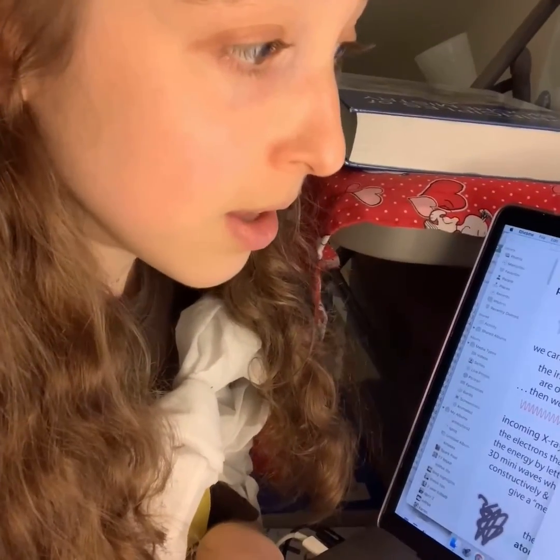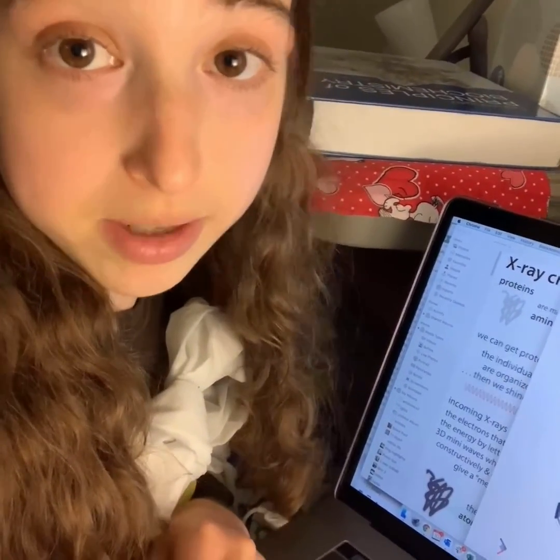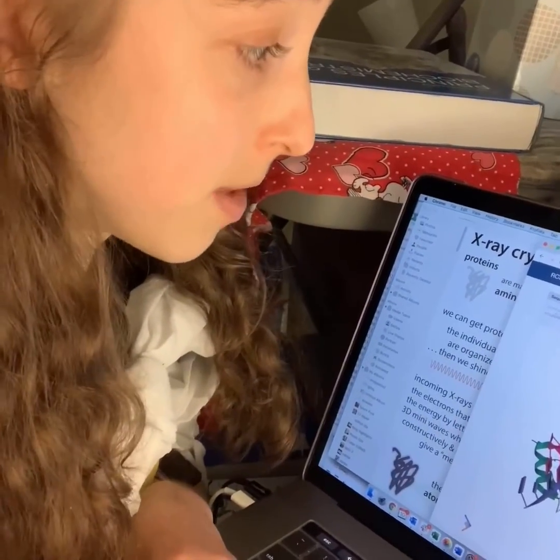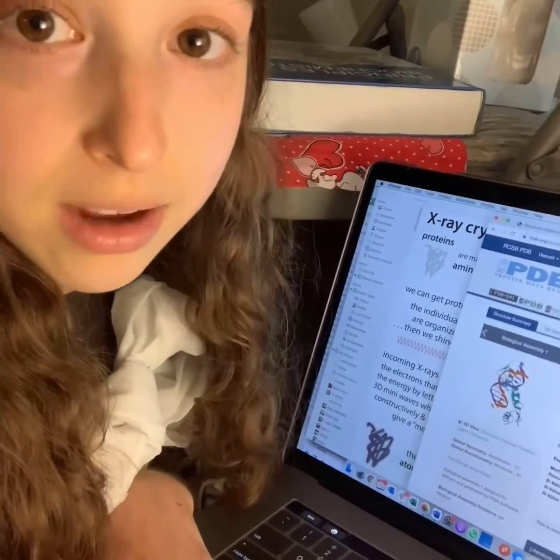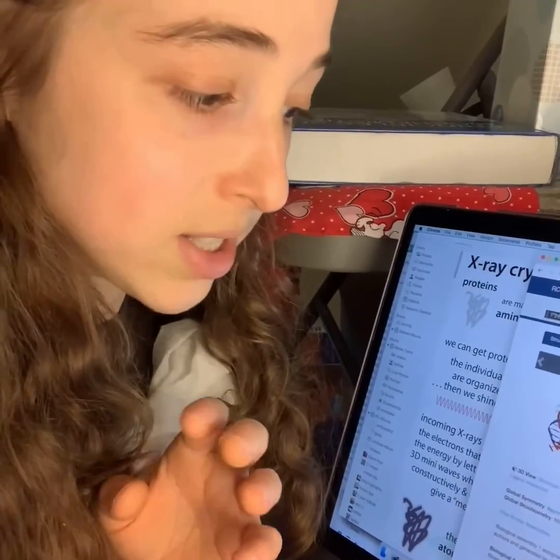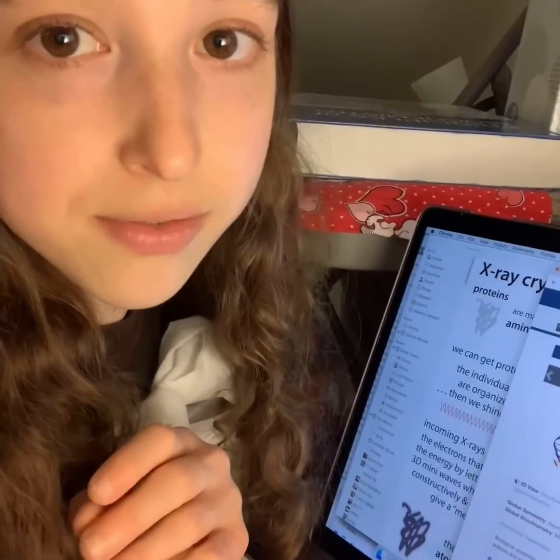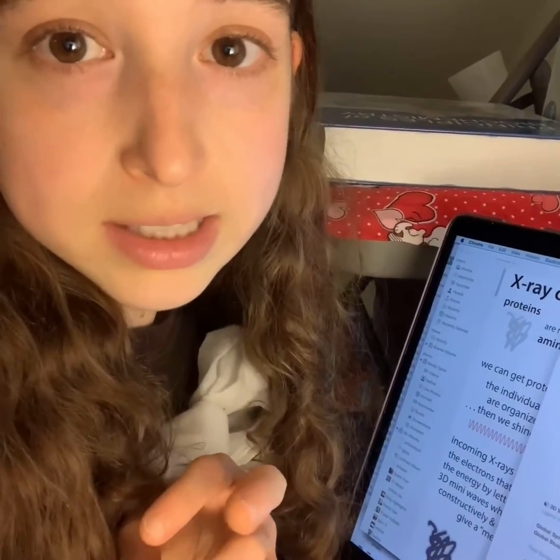the PDB, to find these various structures that you might read about in papers or see pictures of, and actually explore them in more detail, as well as a guide on how to interpret the quality of the data and these various parameters like R value and resolution, clash scores, outliers, all of this stuff. I hope this post will help people see that structural biology is something really cool.